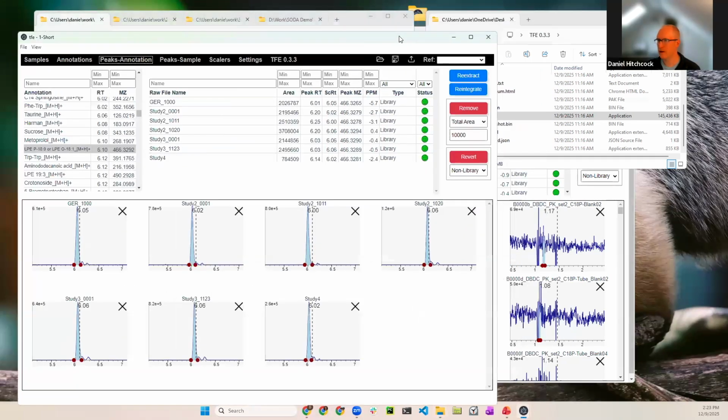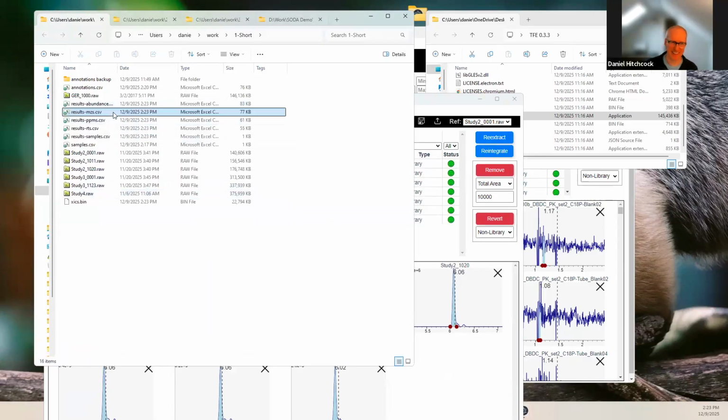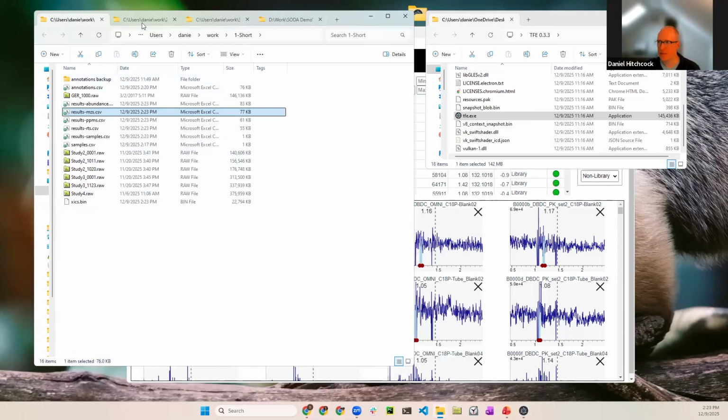Well, it's supposed to save it. Oh, I had the wrong directory, didn't I? Oh, sorry. Let's save. There we go. Export. Okay, there we go. Sorry, I forgot how to use my own software. All right, the next example.